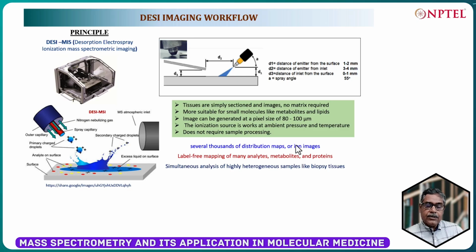Now I'll cite an example where this technology is used to image biological tissue, prostate cancer, focusing on small molecules. Previously I showed you prostate cancer tissue imaging in terms of proteins. Today we will discuss this prostate cancer tissue in terms of imaging of small molecules, metabolites.